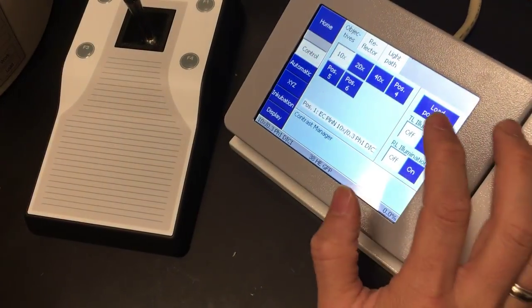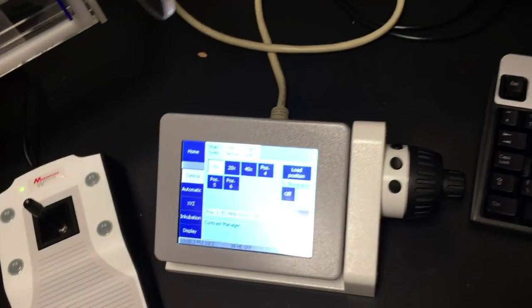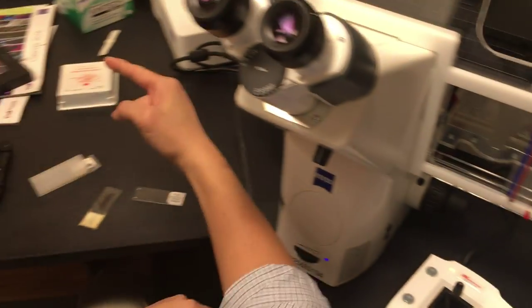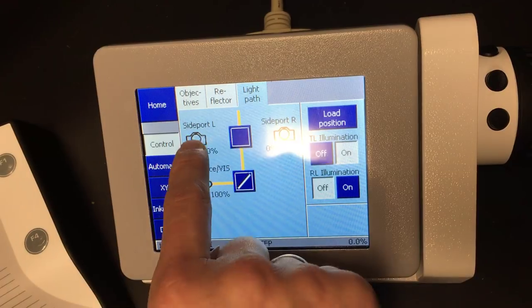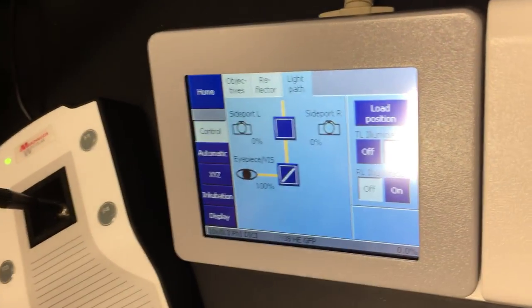If you're going to 10x and you want to look at things in phase, turn the phase ring to phase 1. To do phase contrast, you will have to turn on the TL illumination. Now you can look through the eyepiece. If you don't see anything, the microscope may not be sending light to the eyepiece—it could be sending light to the camera. You can go to the light path and see if it's going to the eyes or the camera. If you want to go to the camera, hit the camera button; hit eyes to go back.